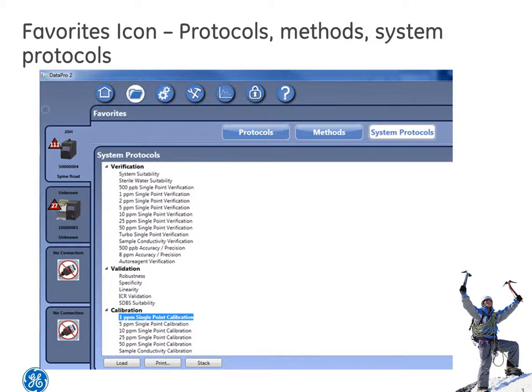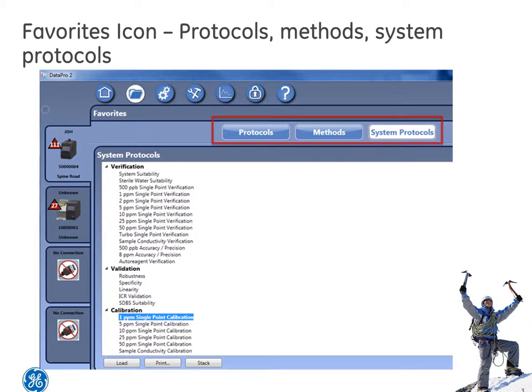Let's have a look at the favorites icon. We are dedicating a special talk on setting up protocols and methods from the favorites icon, but for now let's highlight the three main sections. They are protocols, methods, and system protocols.